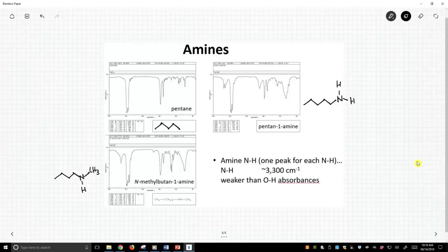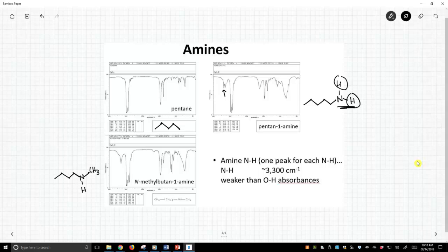Notice that pentanamine has two NHs. Each of those NHs is a little bit different, and they show up a little bit differently. Note, they show up in about the same place as an OH, around 3,300, but they're not nearly as intense.